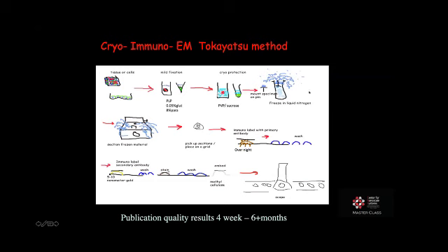We are going to freeze this sample so that we have a hard block that we can section. So before we freeze it, we want to cryoprotect. For cryoprotection, we're infusing our material with PVP/sucrose. This is a 70% sucrose solution with polyvinyl pyrrolidone added to it.